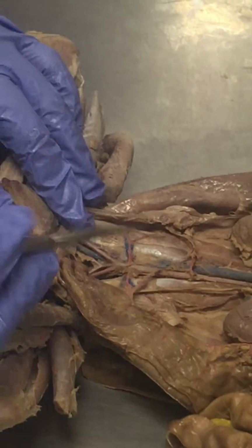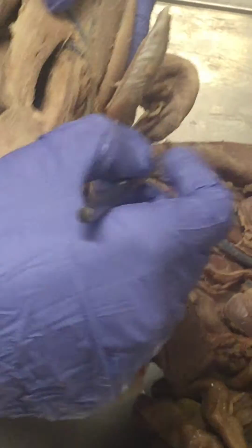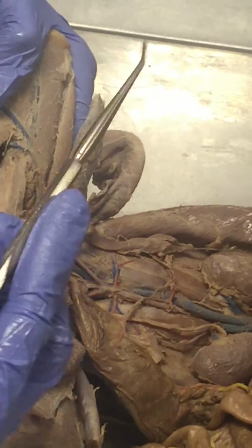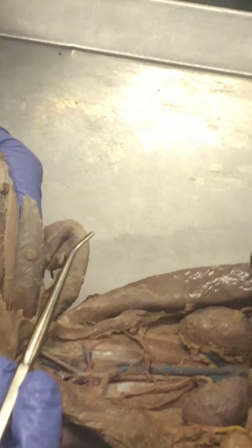Oh, weird. Yeah, they're weirder. So can you guys see that? How it splits here. In a cadaver, how is it different? In a human, it splits here. So human is like what I drew up there. Here's the external iliac, and then here's the internal iliac. So there's no common iliacs in cats.